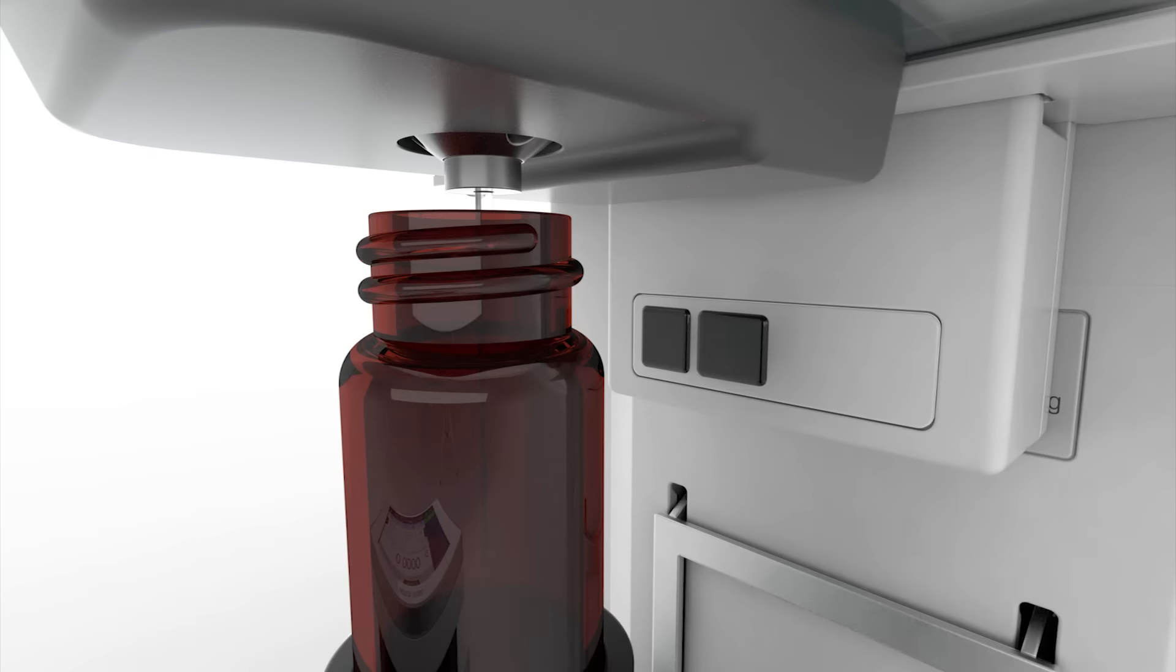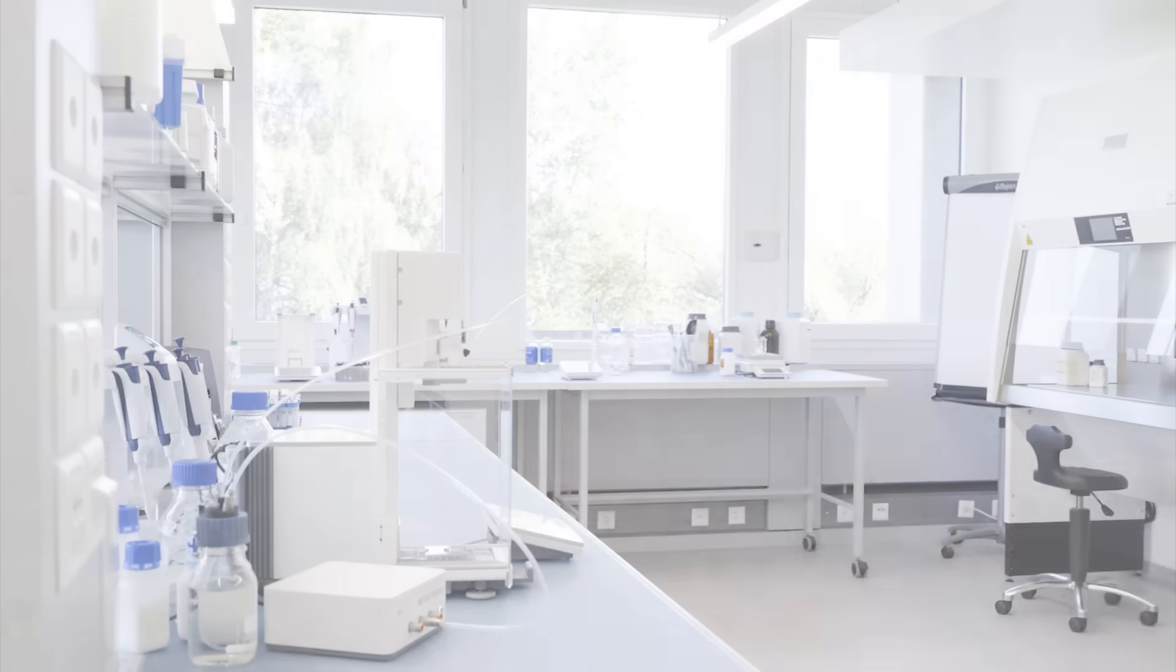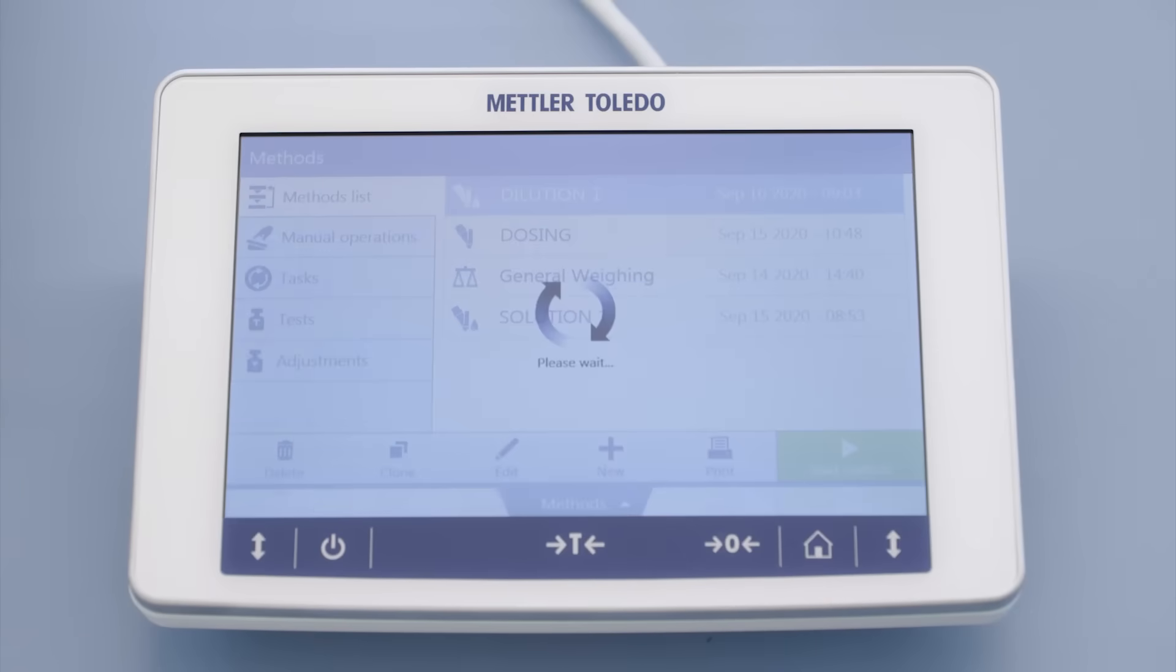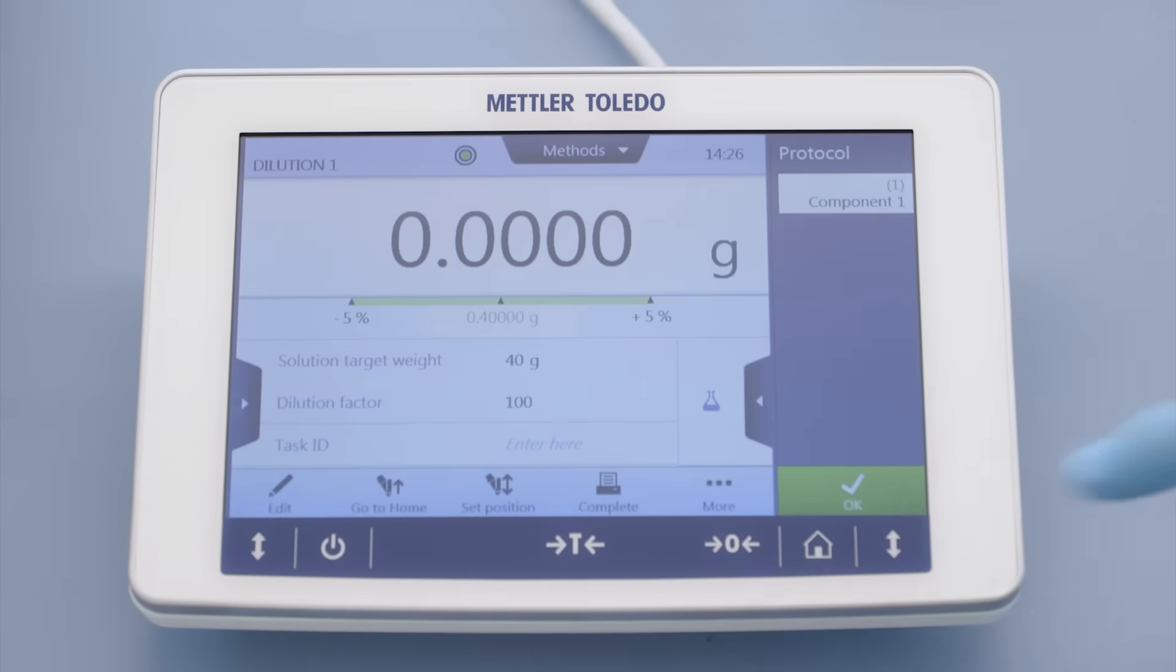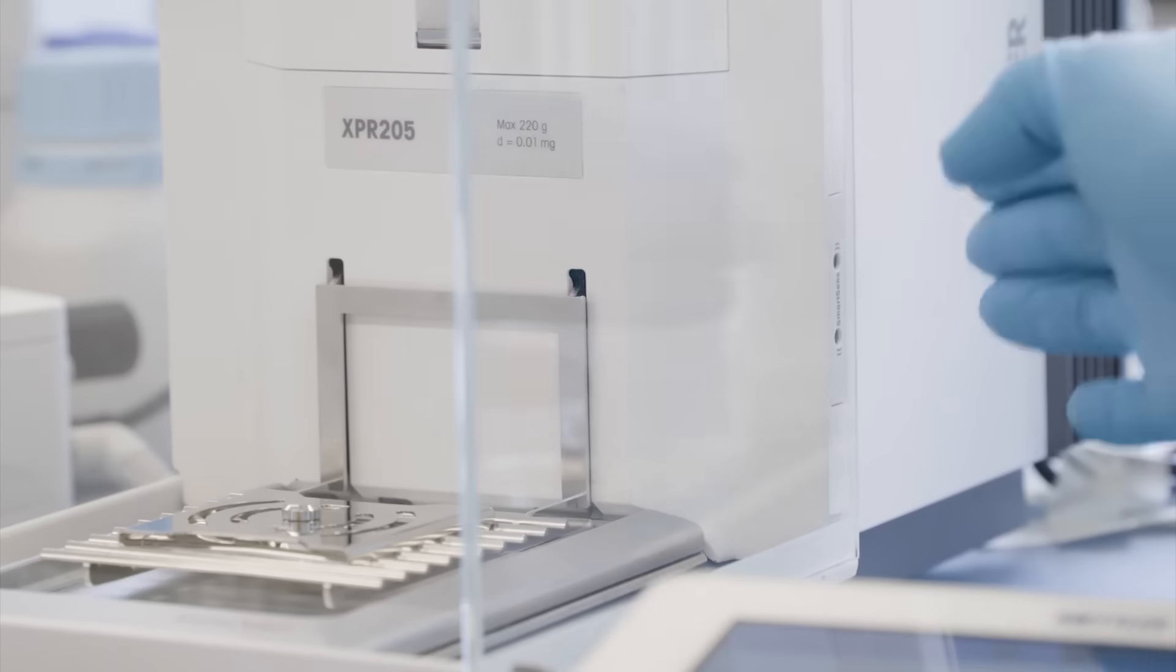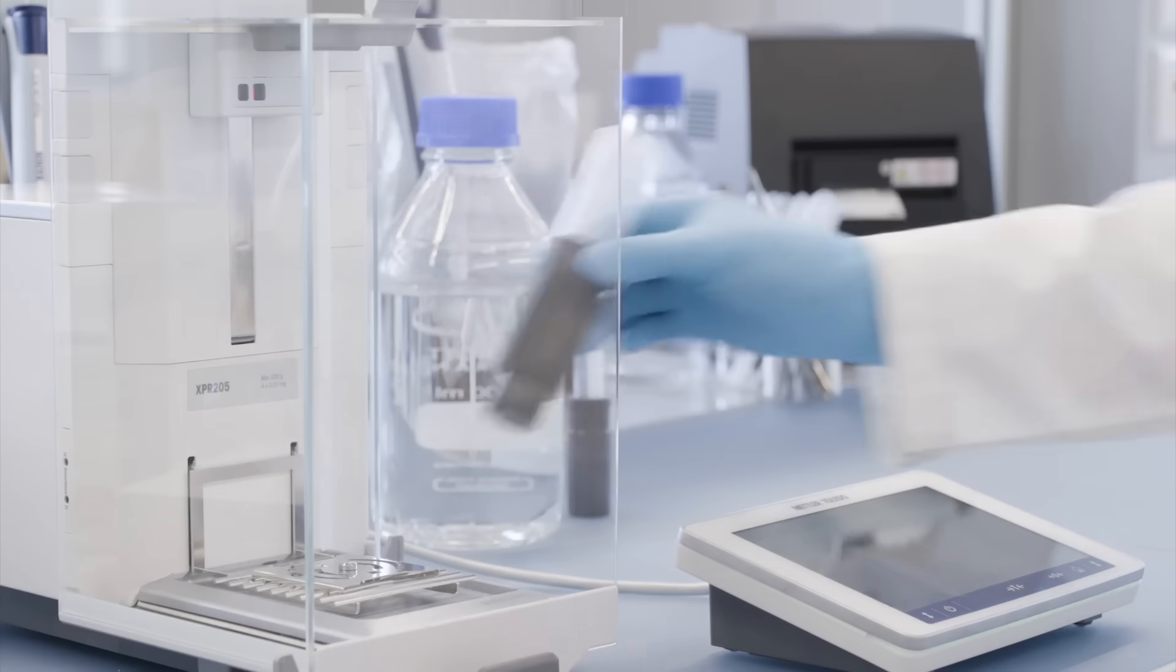The preparation of solutions with accurate concentrations is an essential starting point for many analyses. With the XPR automatic balance, you simply start a method on the balance terminal, define the target volume and the concentration or dilution factor.